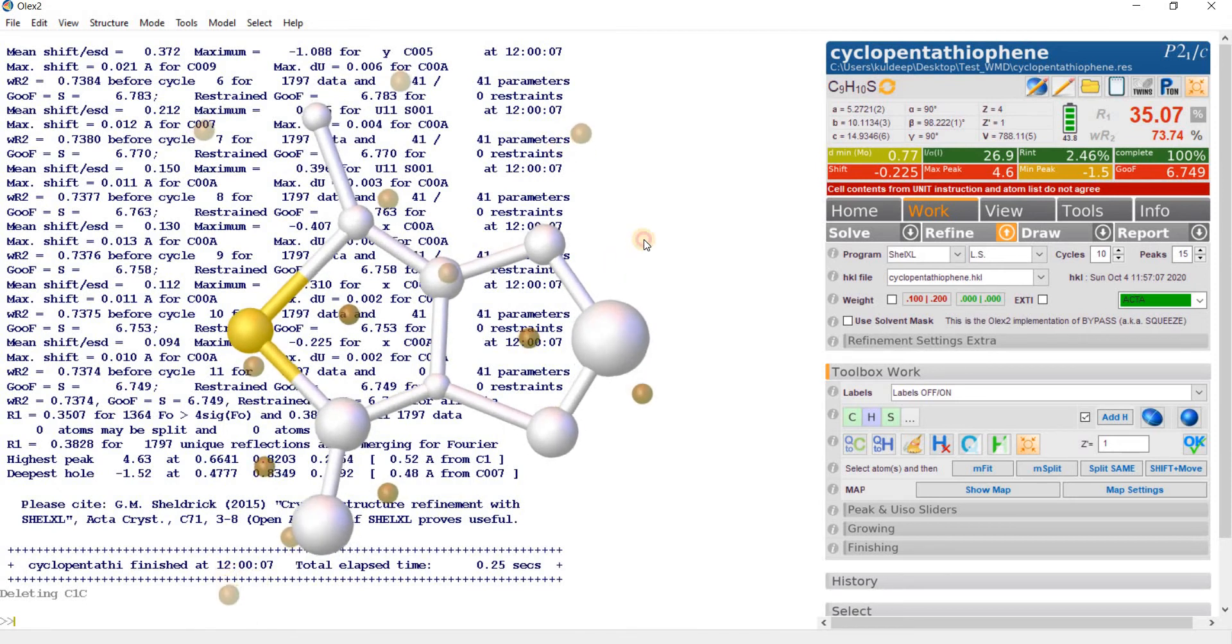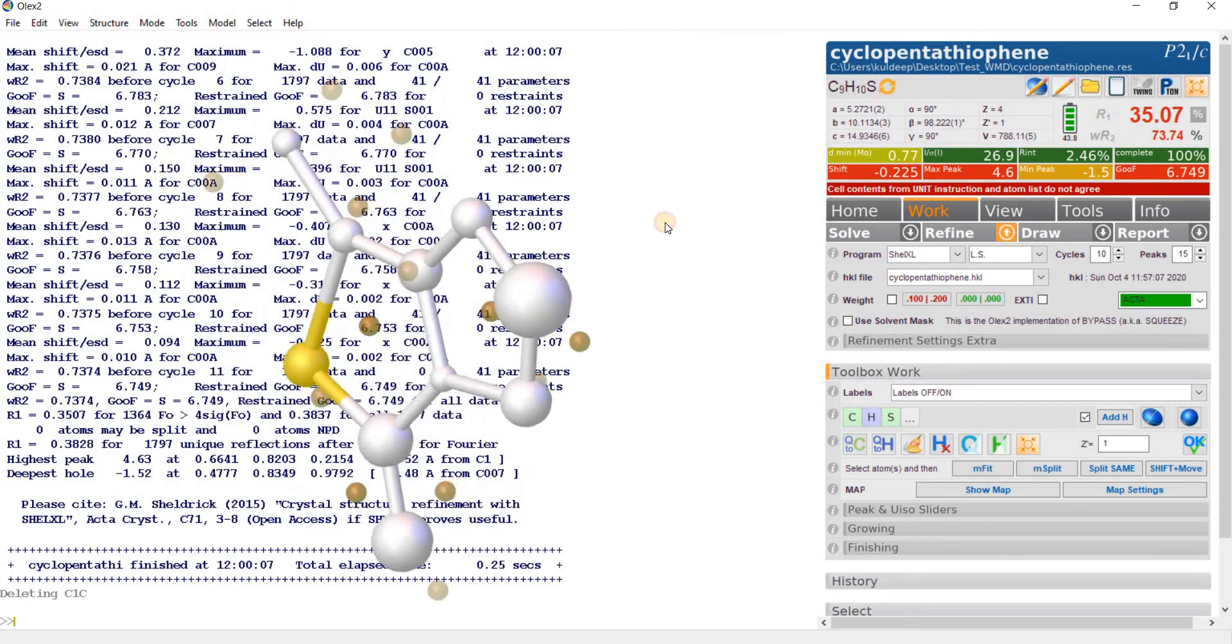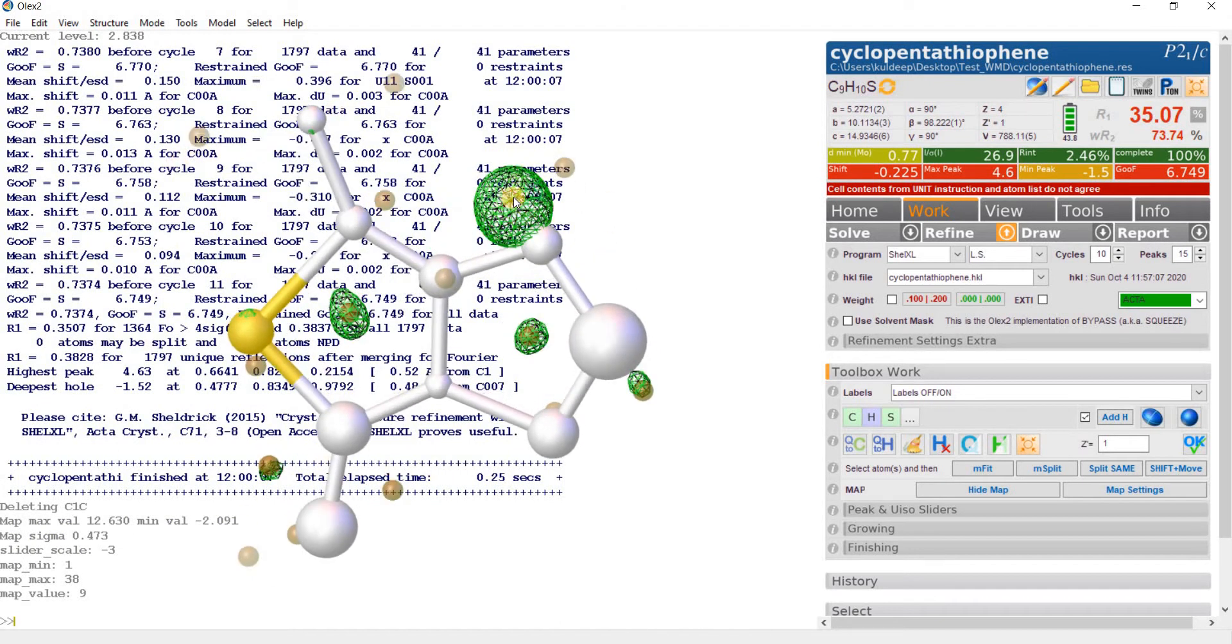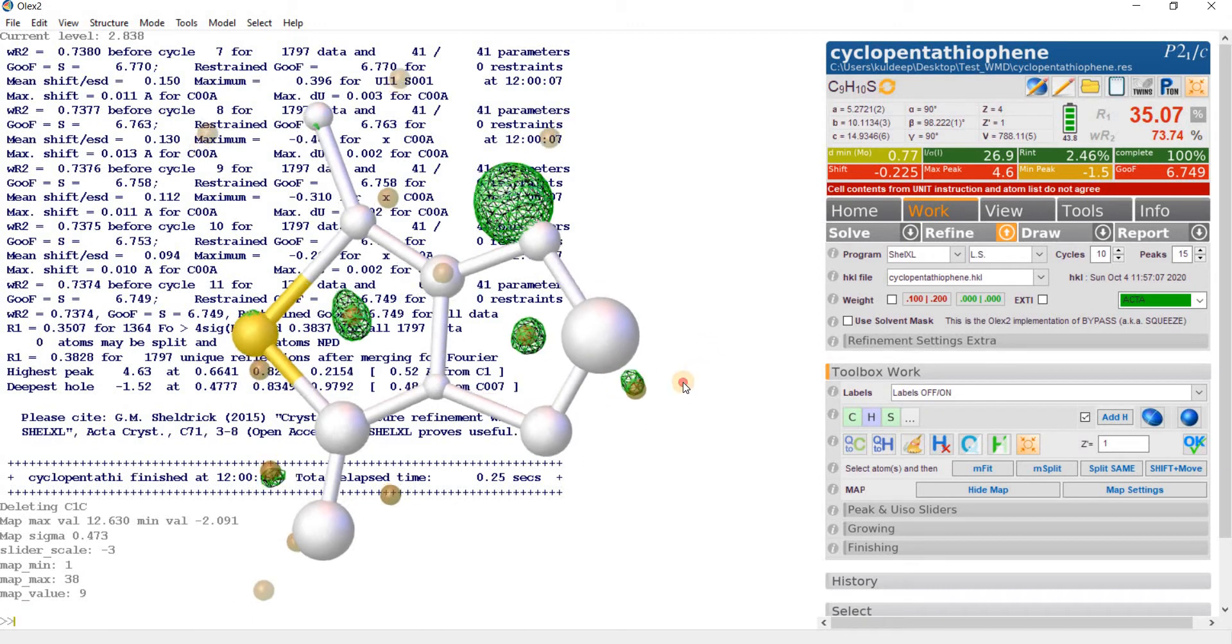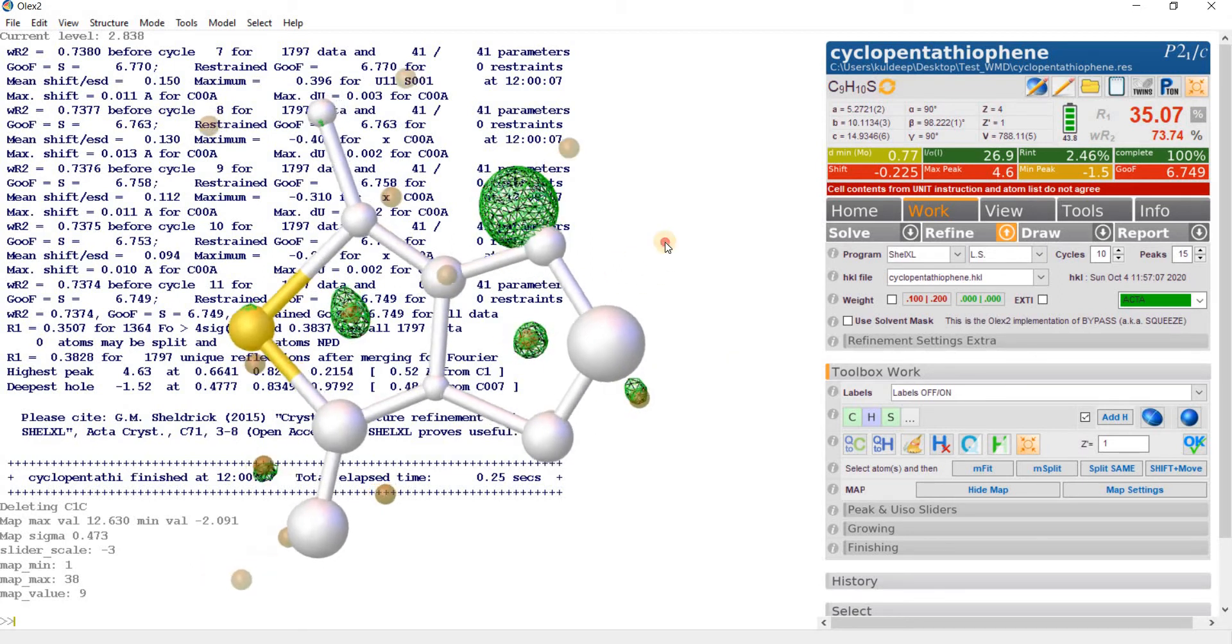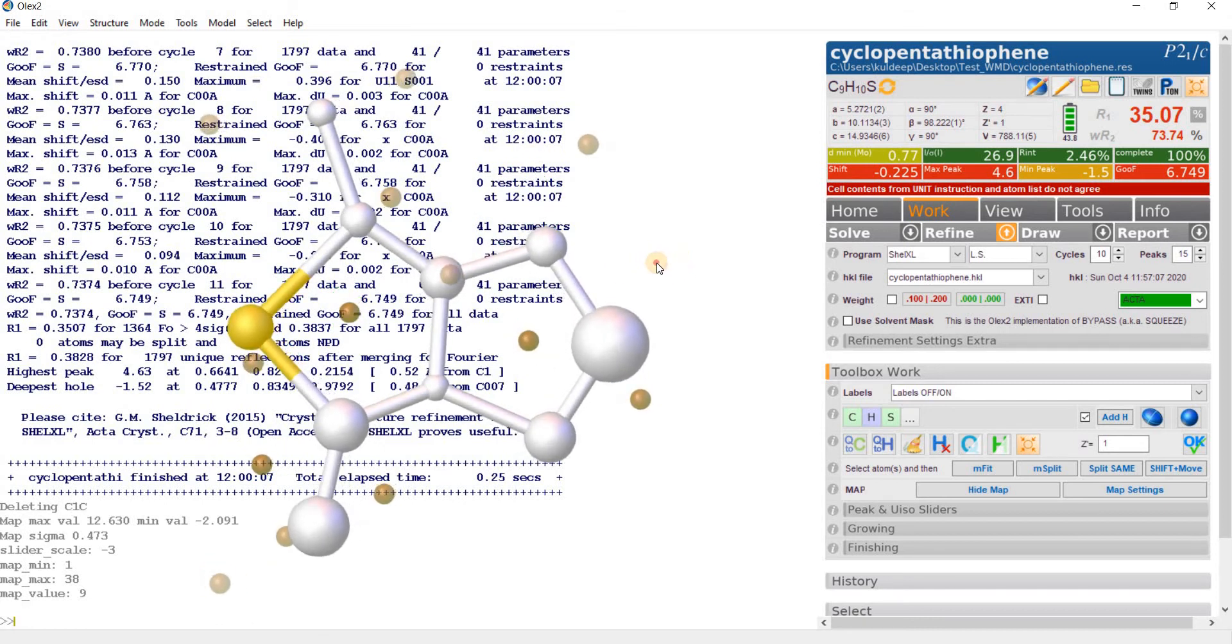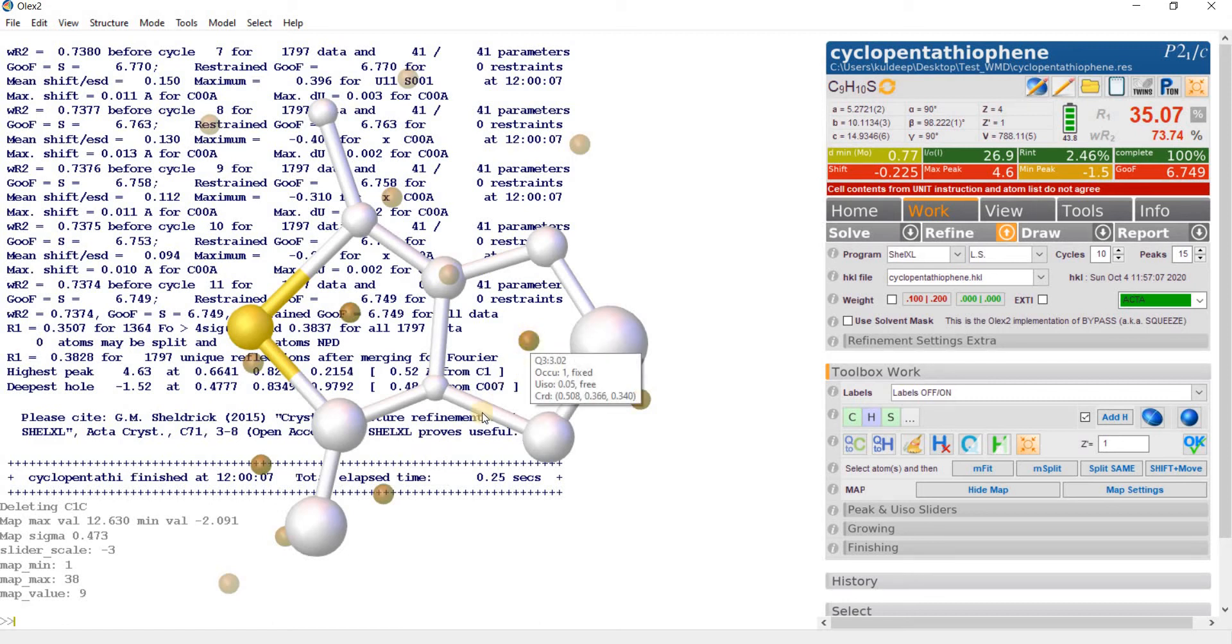A new Q peak is appearing here. Let's delete this one and make this carbon. Now it is more reasonable. Let's refine it. Again the same problem is arising; the thermal again becomes too small at 0.0024. A new Q peak is appearing here with height approximately 4.5 electrons, so it may be carbon. Select this, make it carbon, and delete this one.